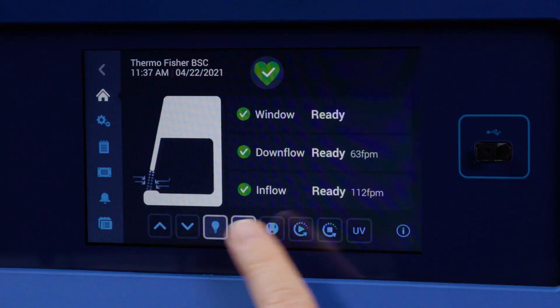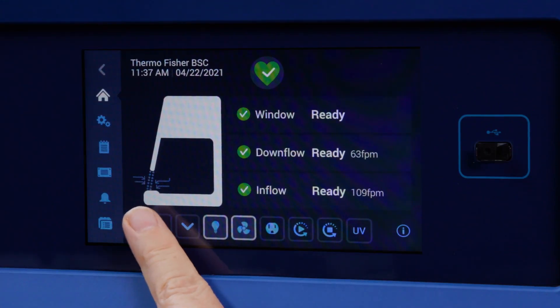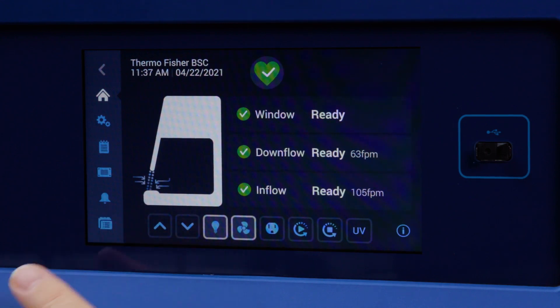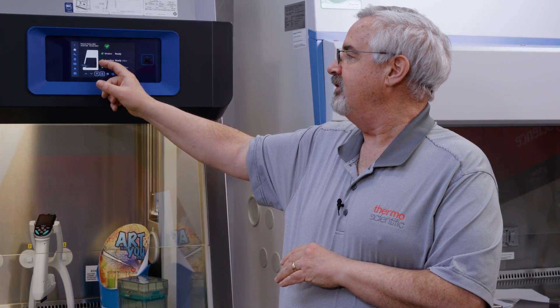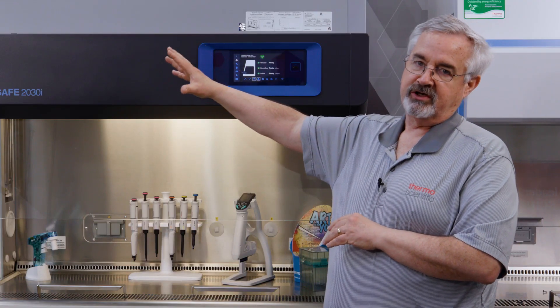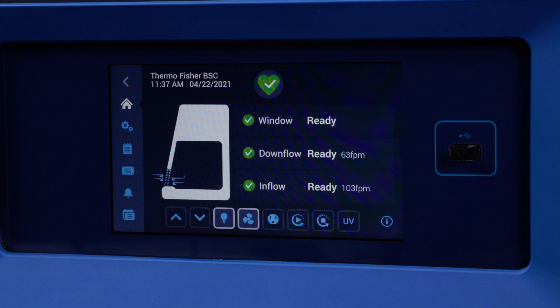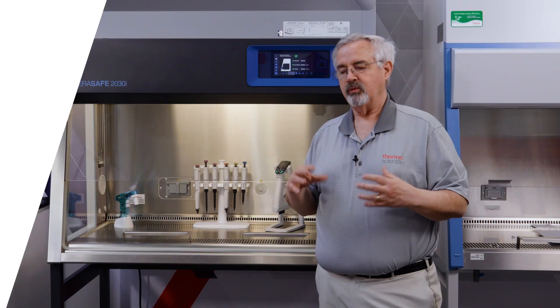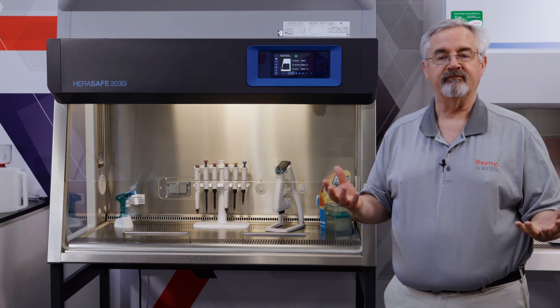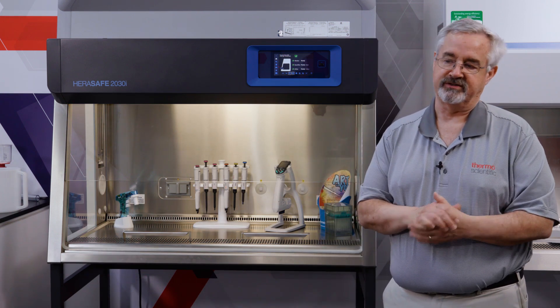Now the airflow has stabilized. You see the air barrier is represented with the gray dotted line, showing that it captures the downflow air inside the cabinet before it escapes and captures air trying to reach the cabinet before it can get inside. One way to evaluate cabinets is the four C's: containment, comfort, convenience, and cost.